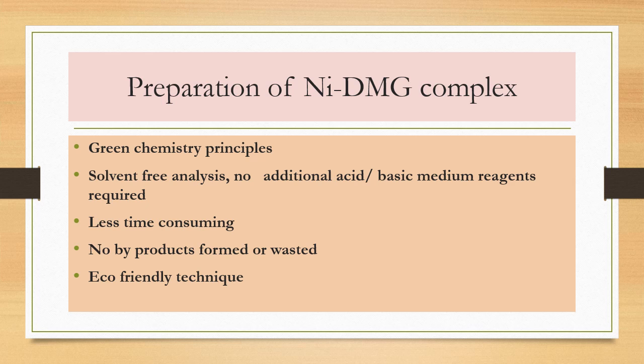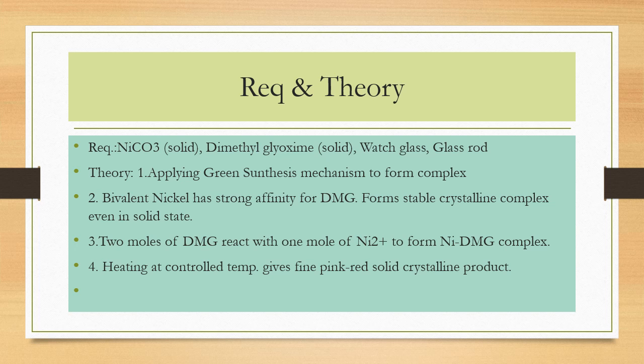Very quickly you can find out that the complex is formed by simply addition of metal and ligand in solid state. So this is again one of the remarkable features of this complex, that the entire reaction is carried out in solid state. No byproducts are formed and it is highly eco-friendly. One should know the starting material. Here we are using nickel carbonate. It is in anhydrous form, and the ligand is dimethyl glyoxime, which is an organic reagent.